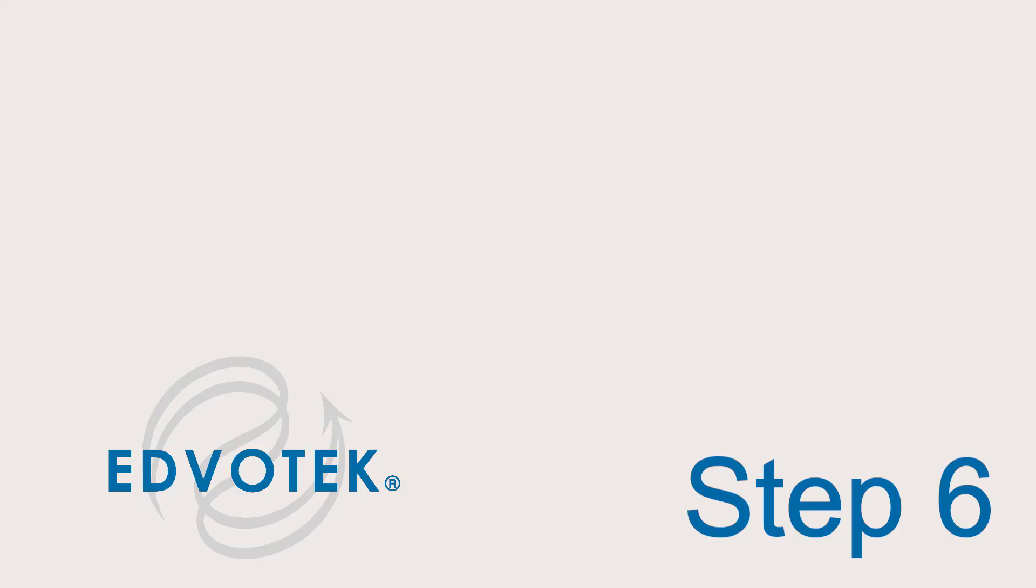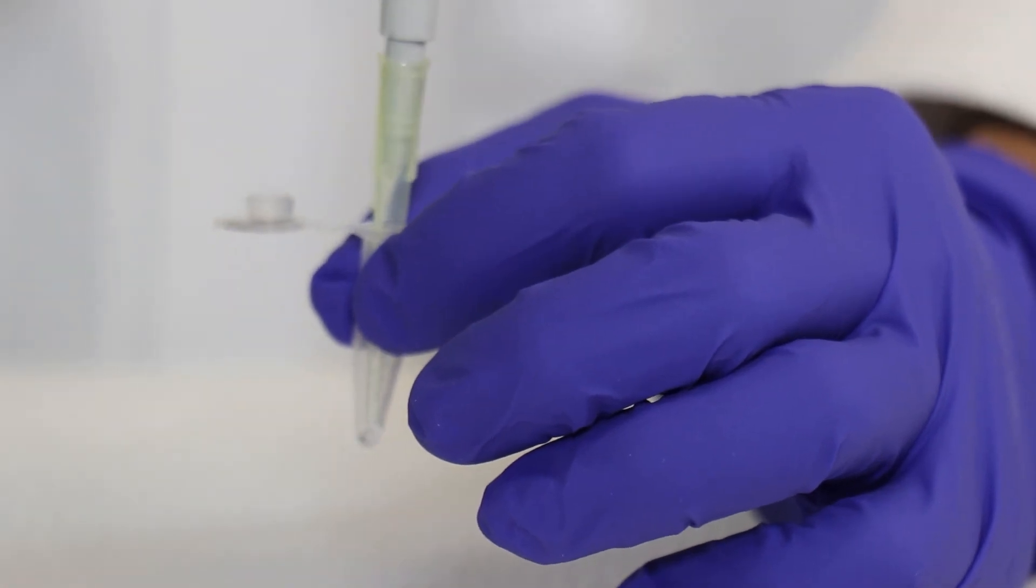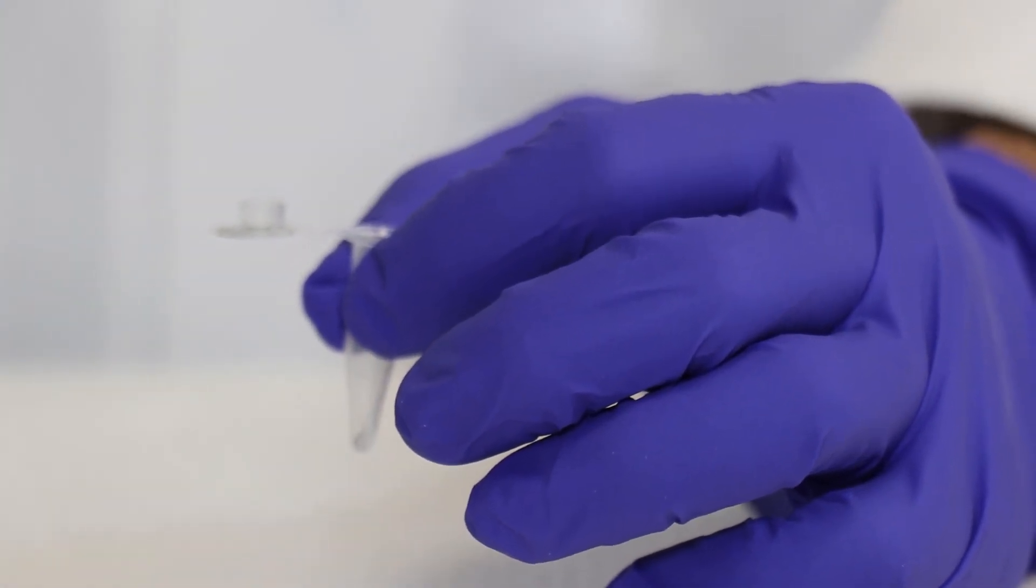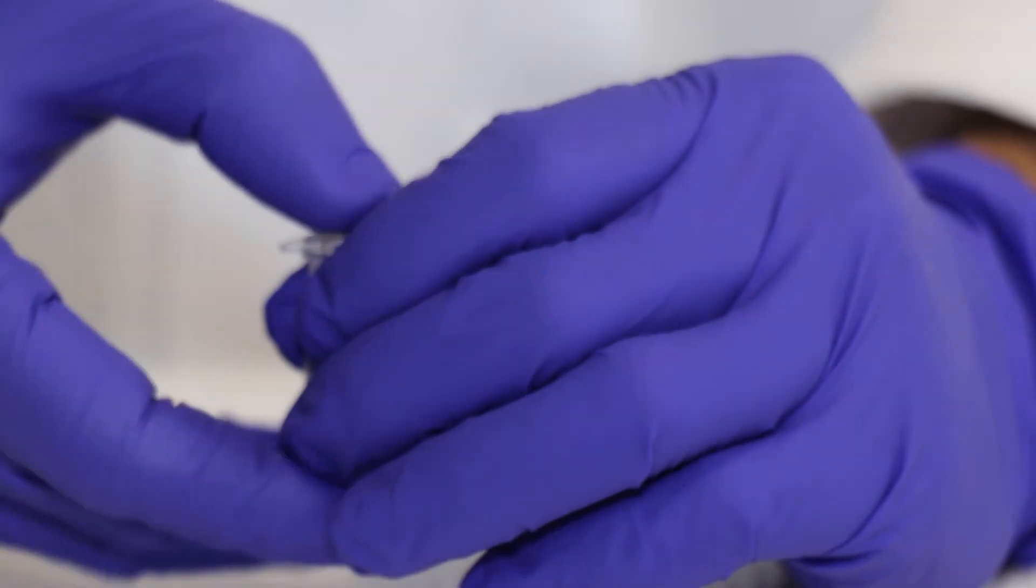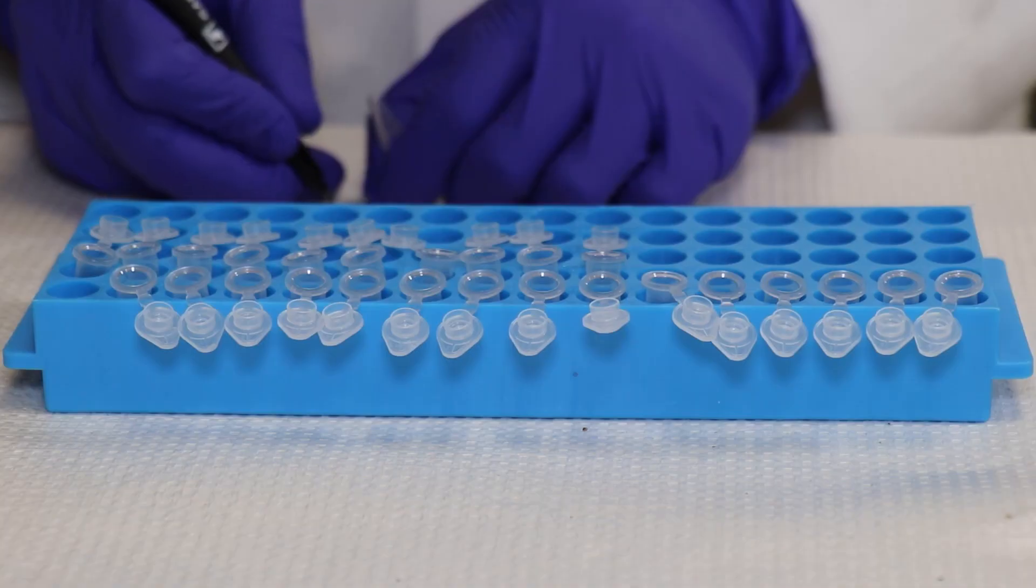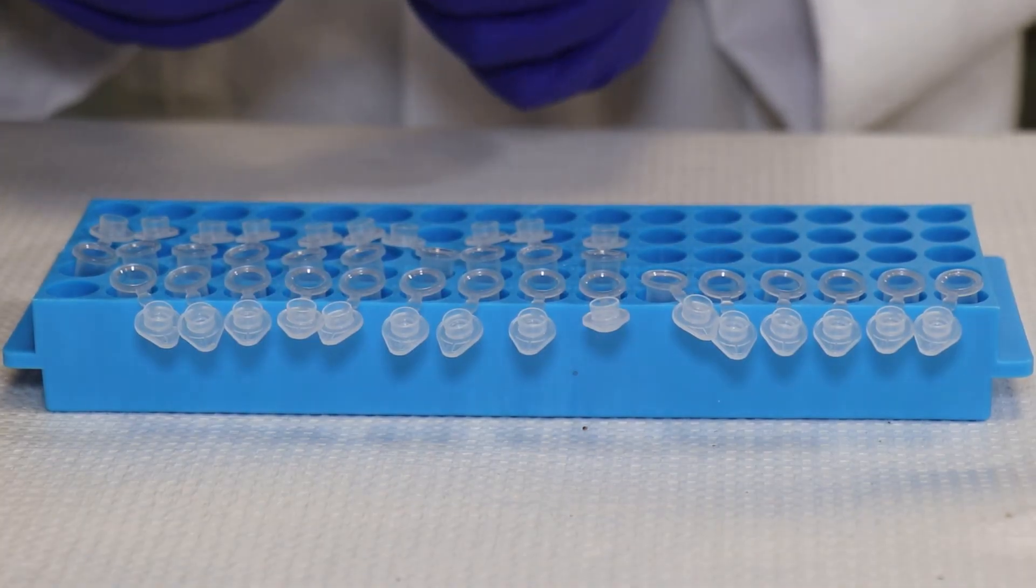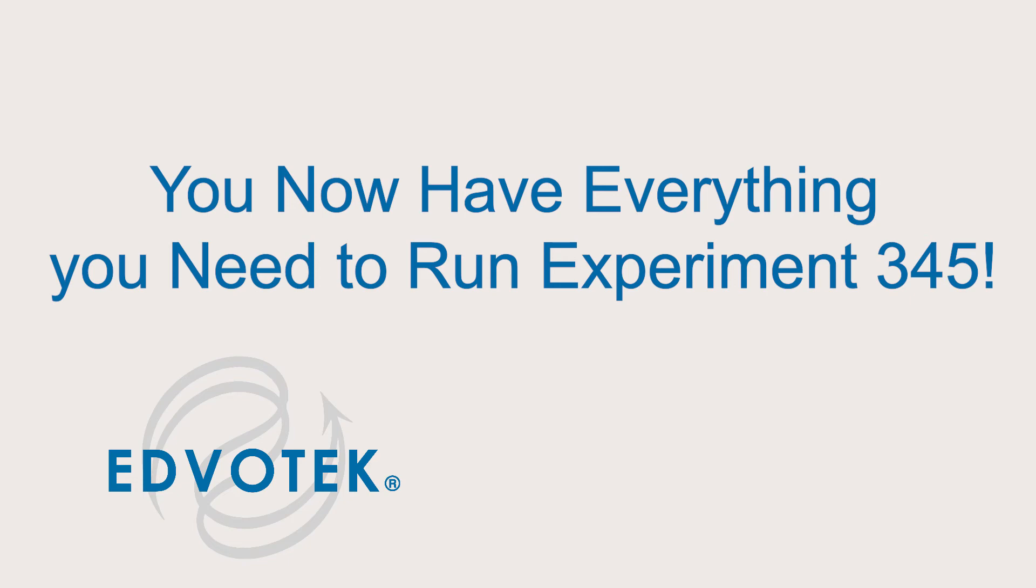Step 6: dispense 6 microliters of the H3 restriction enzyme into 25 tubes. Label these tubes H3. You now have everything you need to begin experiment 345: exploring the genetics of taste, SNP analysis of the PTC gene using PCR.